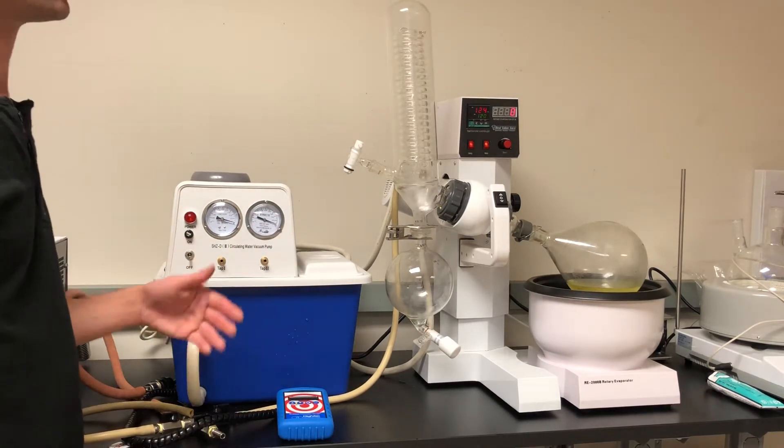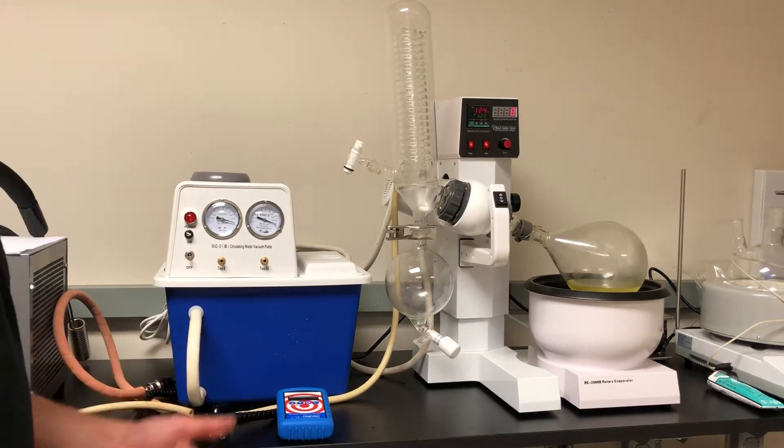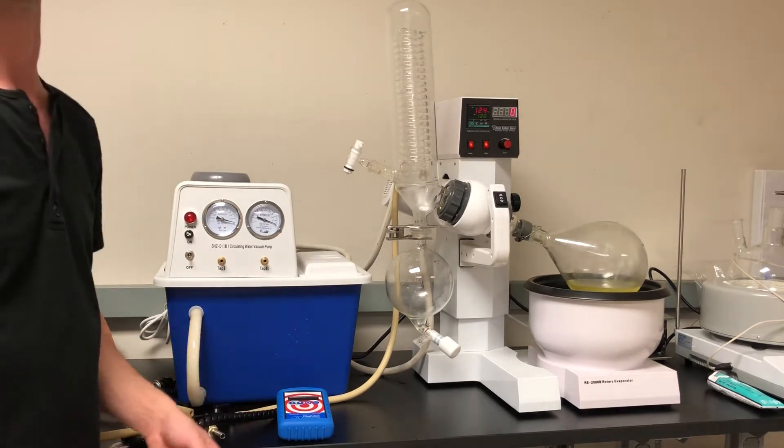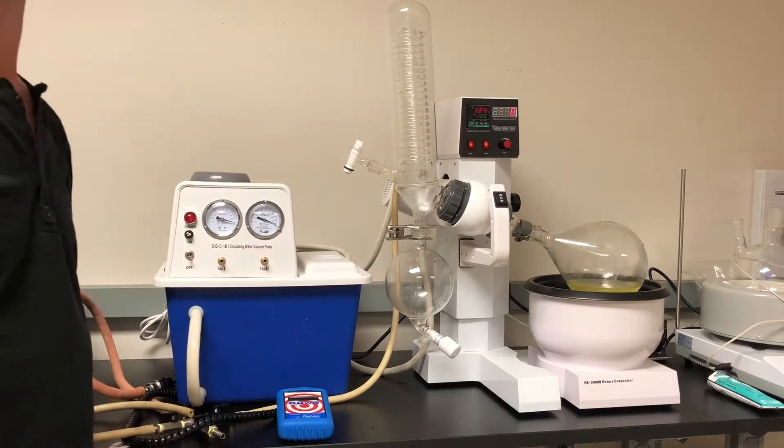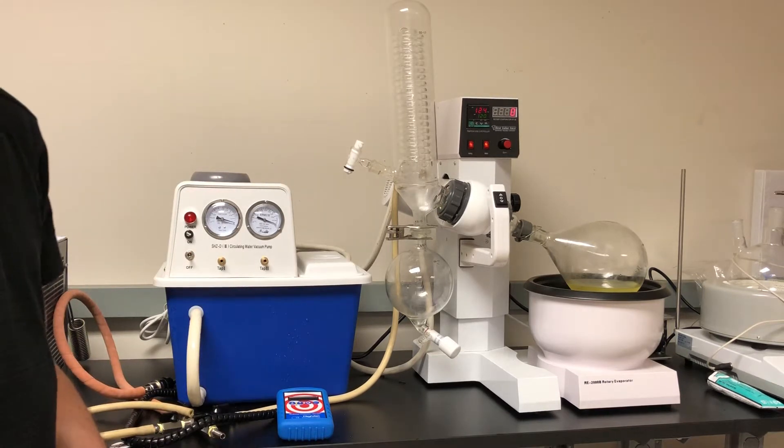The vacuum that it produces will pull down to 29 inches digitally, but the micron level is actually very high, which means it's really good for this type of application or anything that doesn't require a very high micron or deep vacuum pull.